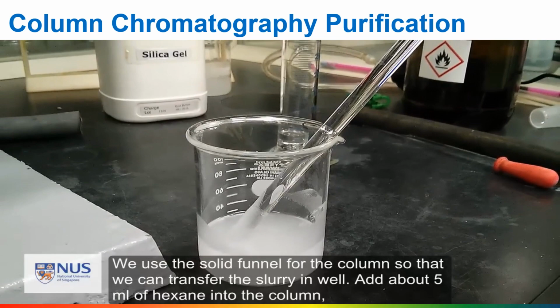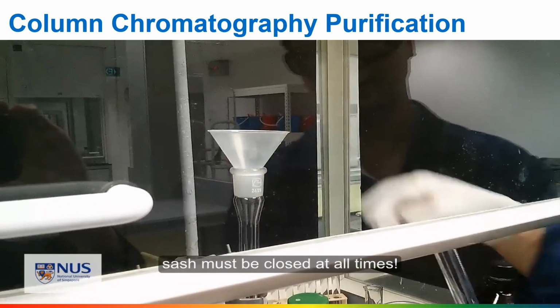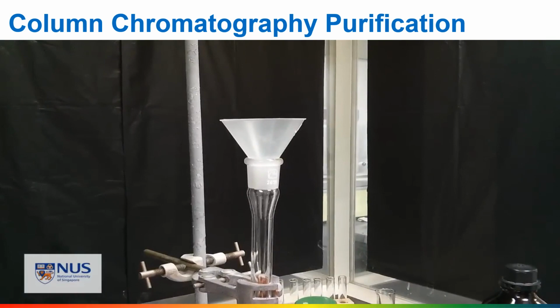We use the solid funnel for the column so that we can transfer the slurry as well. Okay, add about 5 mL of the hexane into the column. At all times, the sash must be closed. This is to prevent the breathing in of the toxic silica gel into our lungs. You may get silicosis, which is very harmful to our body. So take note, sash must be down. Here in the video, we're just doing a demonstration, so it's up.